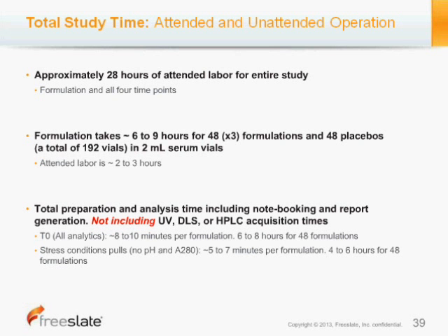Now, this doesn't necessarily include the UV or the DLS or the HPLC acquisition times, because those can be significant, and it depends on your methods, and on whether you run those in parallel or not.